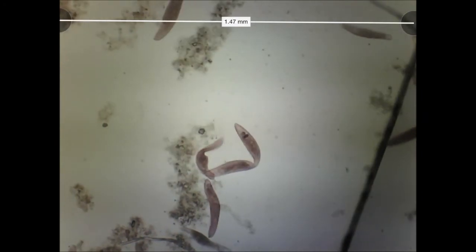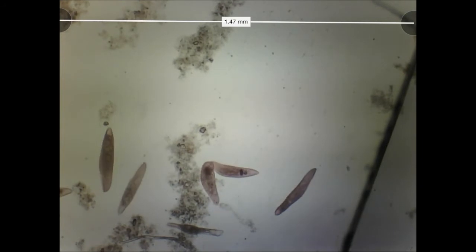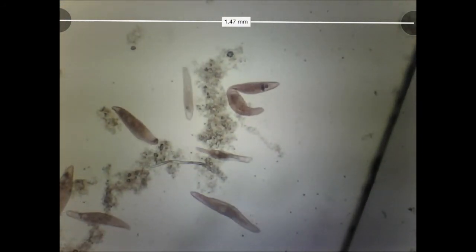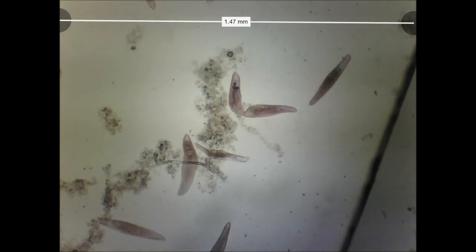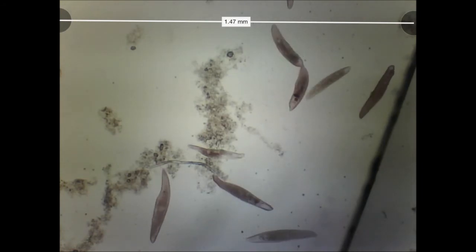But here we have this very unusual capture where end-to-end they're almost at the end of the cell division process. You can see they look like two fully formed adult cells. They just haven't made that final bit of cytoplasmic split yet.